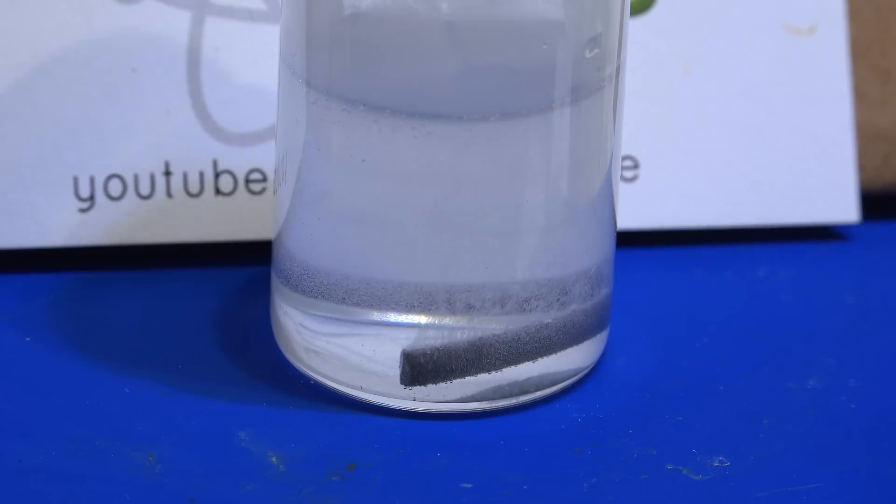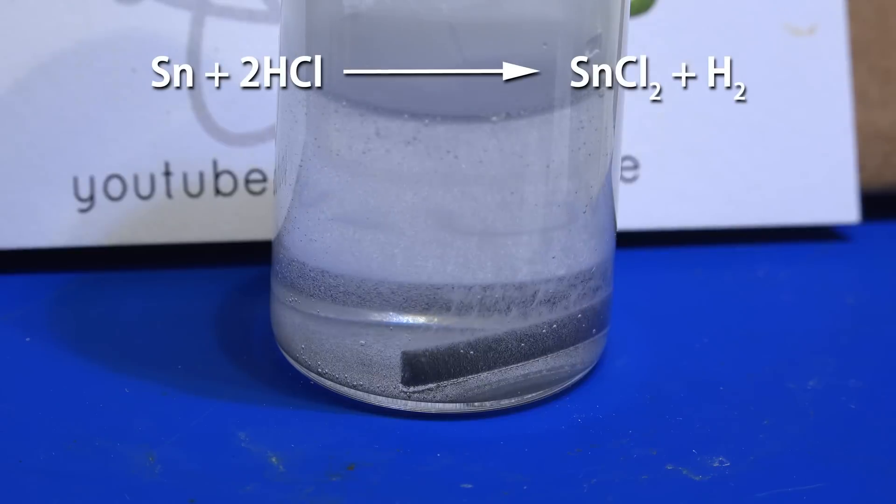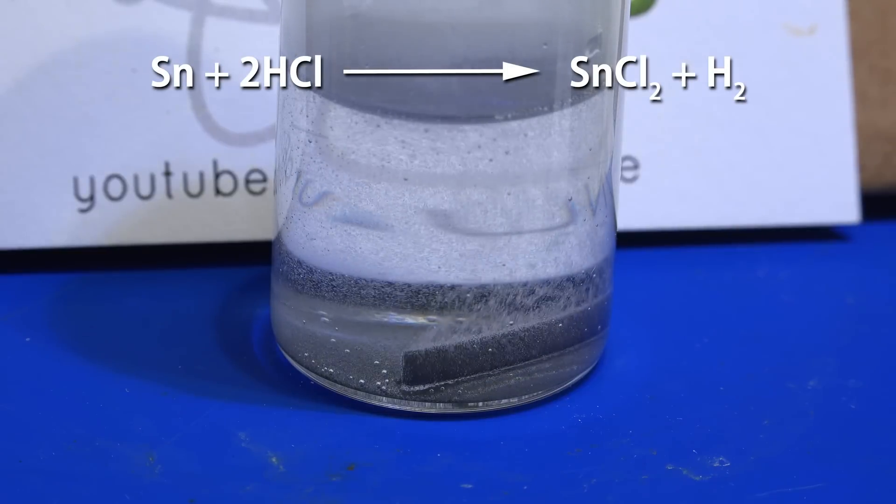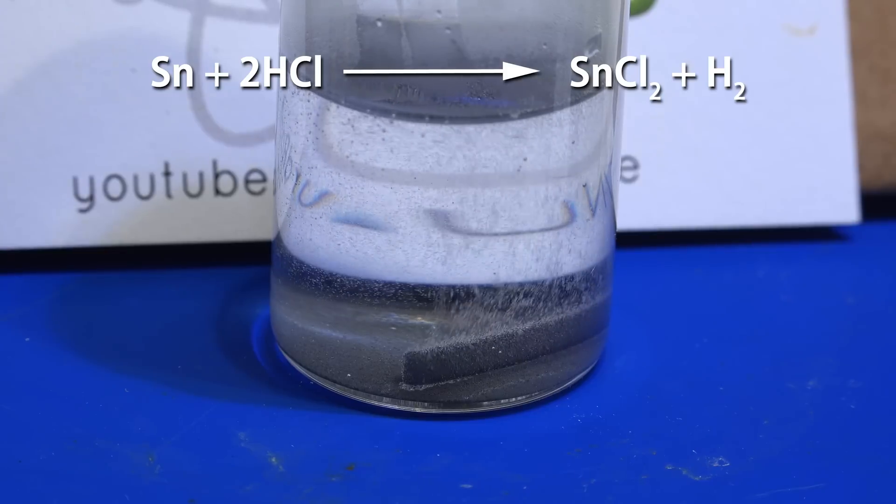Let me zoom in for a better look. What's happening is the tin is reacting with the hydrochloric acid to make hydrogen gas and tin chloride.